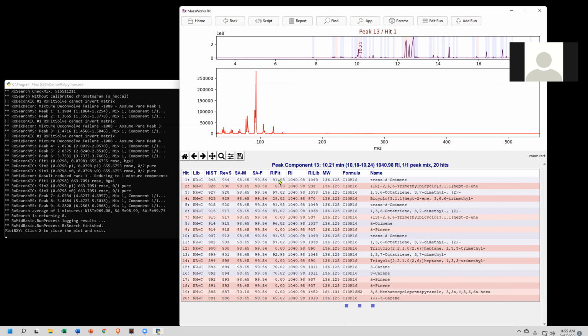But the retention index is the only thing that's going to help us out for these kinds of compounds. And what you'll see here is, well, that's 91, that's 97. I don't have 100% confidence that that's the right one and not that one. It's got a little better NIST match values, but again, as we've seen, you can't really depend upon that. You have to consider all the good matches, but we can eliminate a lot of the compounds.